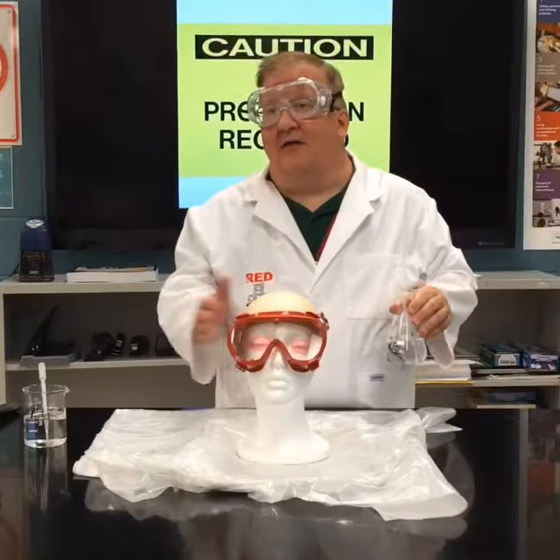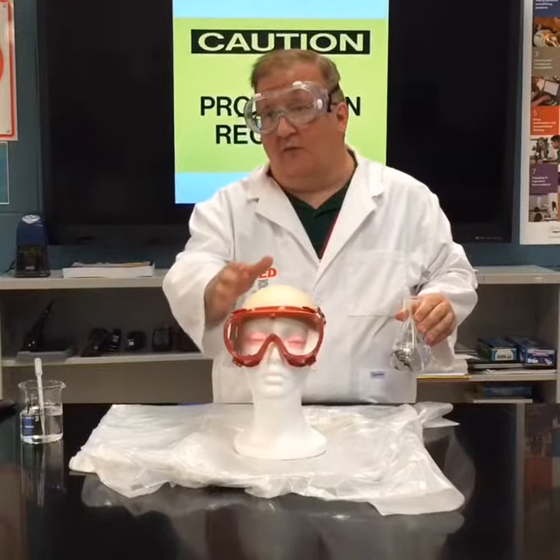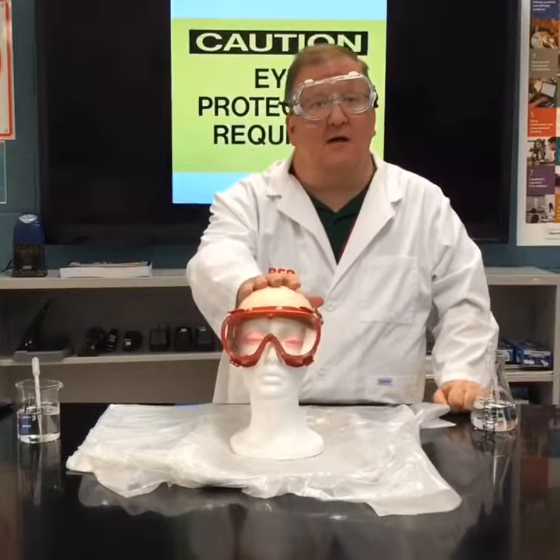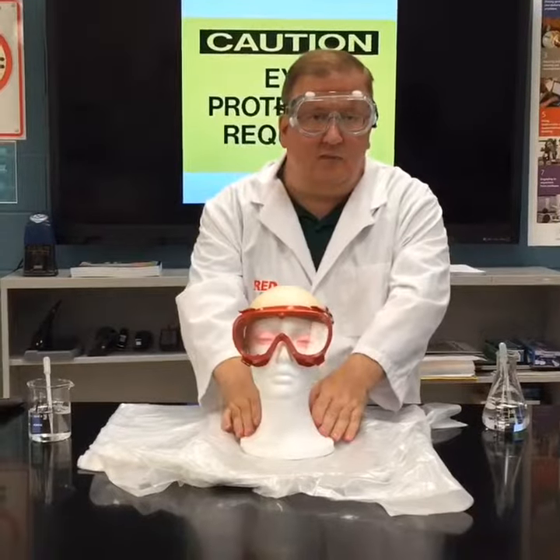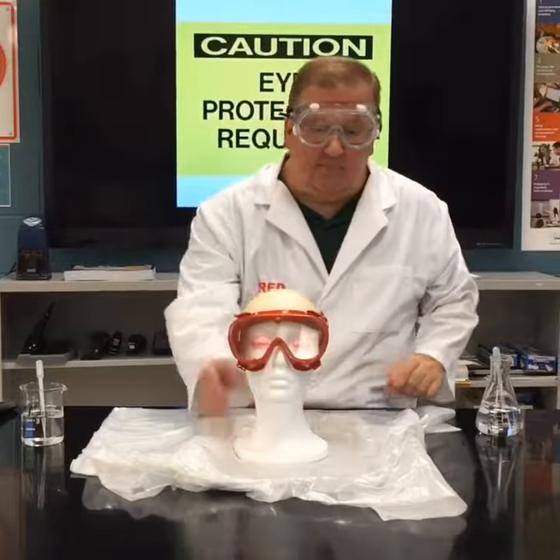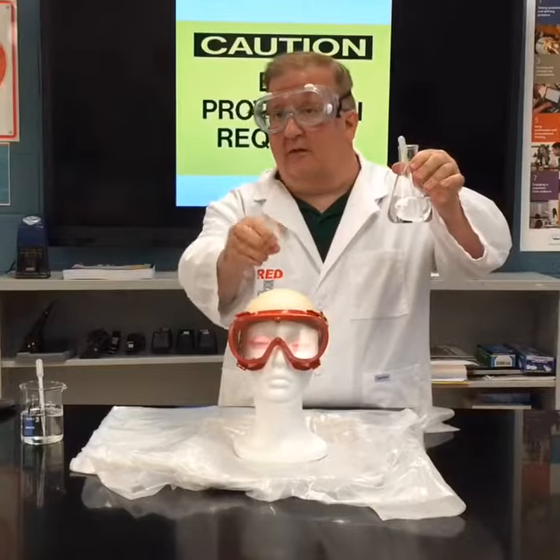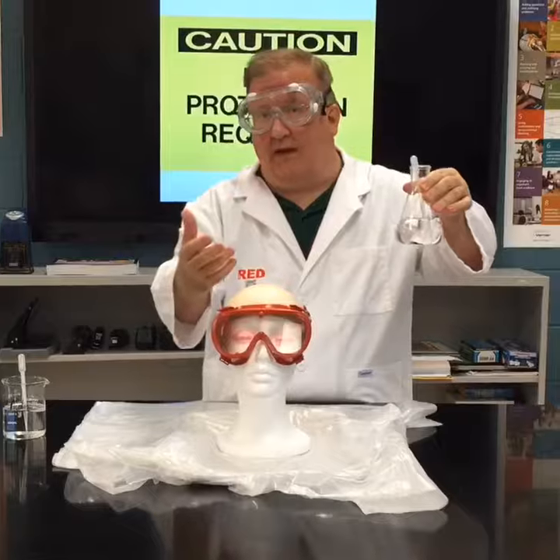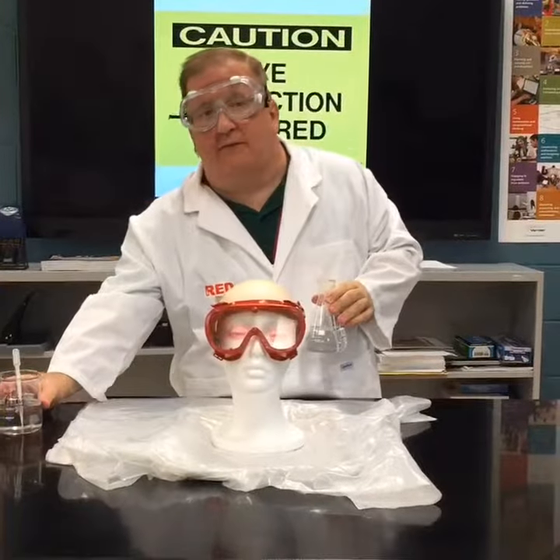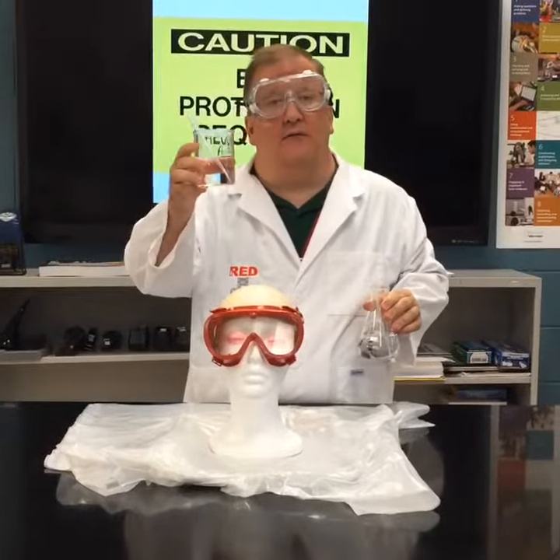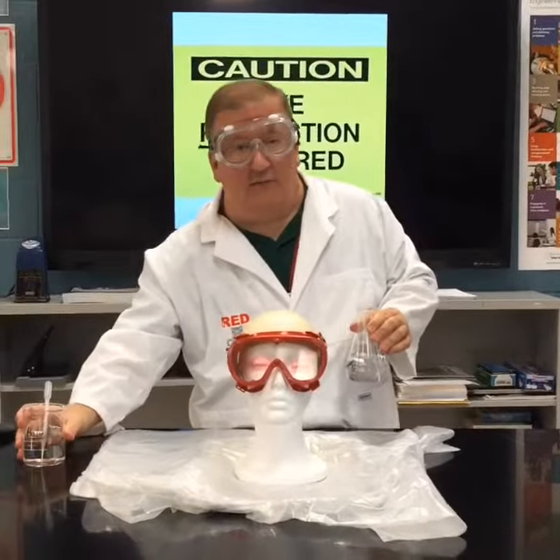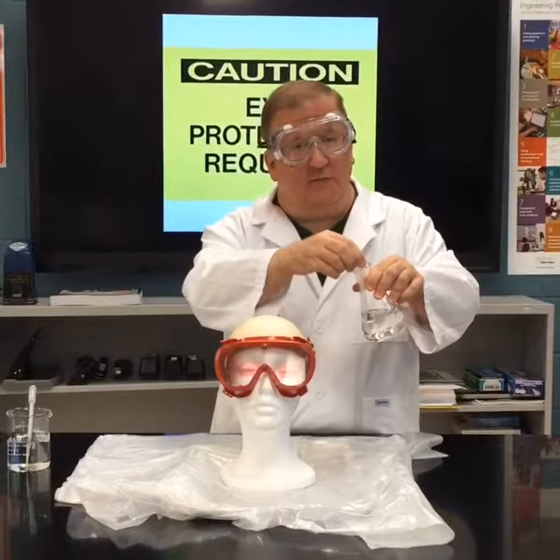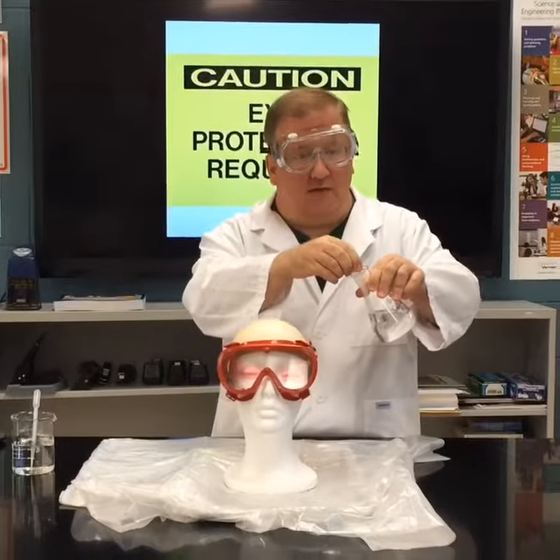This demonstration shows you how different chemicals can react differently according to the substance that they come in contact with. We have the wig cap which is made of nylon, on the mannequin head which is styrofoam. I'm first going to pour a drop of sulfuric acid onto the nylon wig cap, then use some acetone which is a key component of nail polish remover, to demonstrate how different chemicals can react differently according to the material they come in contact with.